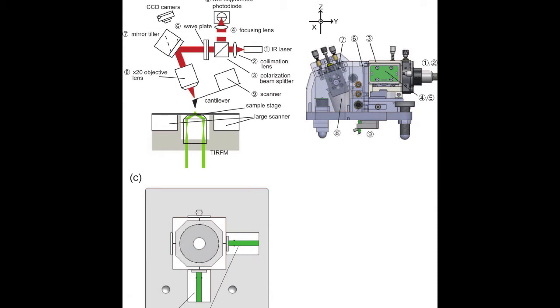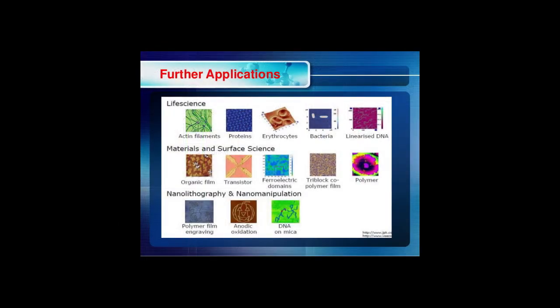The next prototype was a small cantilever AFM, version 5. The major difference between this AFM and the previous AFMs lies in the optic design of the microscope. This prototype has a much smaller laser spot, allowing for the smaller cantilevers to be used. It also includes an integrated illumination source, essentially combining an optical microscope and an atomic force microscope in the same piece of equipment. Improvements in instrumentation and the understanding of the atomic force microscope have led to its wide use in many fields in engineering, material science, and biology.